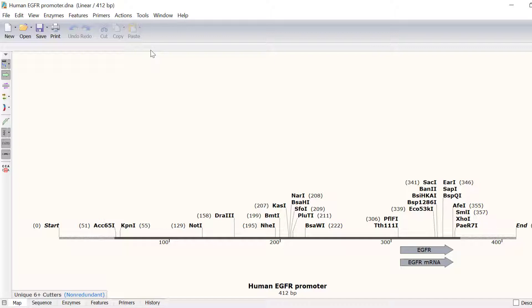To perform insertion cloning, we must ensure the vector and insert contain compatible restriction sites flanking the region of interest.